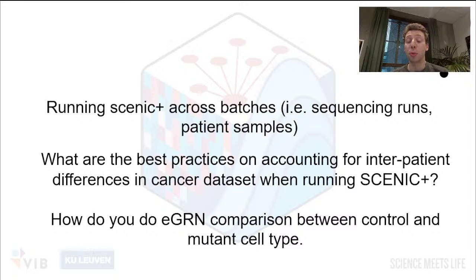What you could consider doing is to subset your data only for the cell types of interest, and then keep case and control. And as long as there is enough difference between case and control, you might be able to find some regulons that are different between the two. But like I said, there's no one way of doing this.